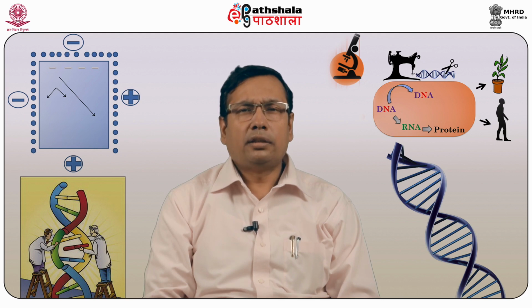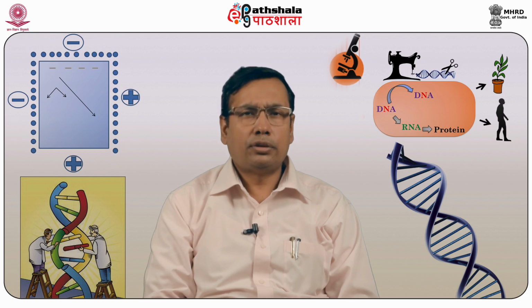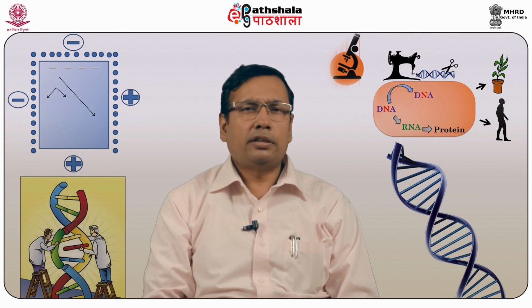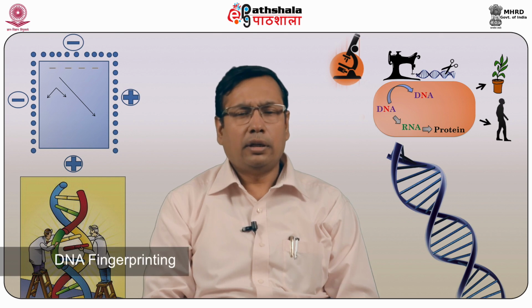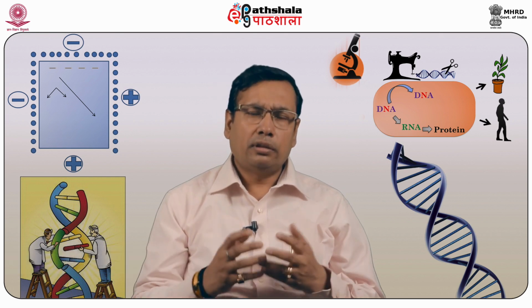To summarize, PCR is a very powerful technique in molecular biology where you can amplify even the tiniest amount of DNA with the help of suitable primers. The applications of PCR are in many places, like forensic medicine and DNA fingerprinting. You can also use PCR for cloning.